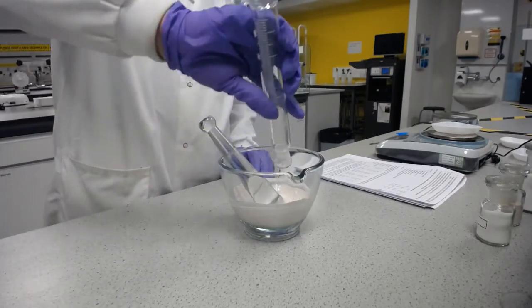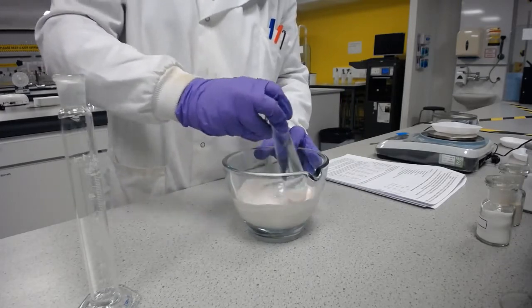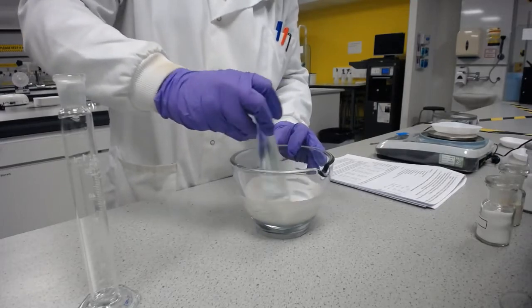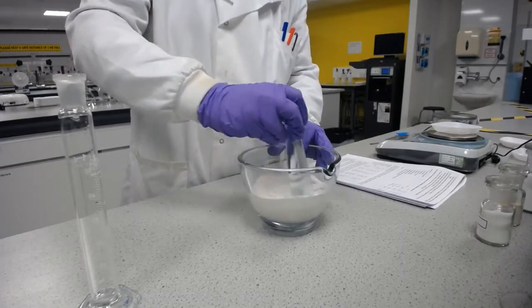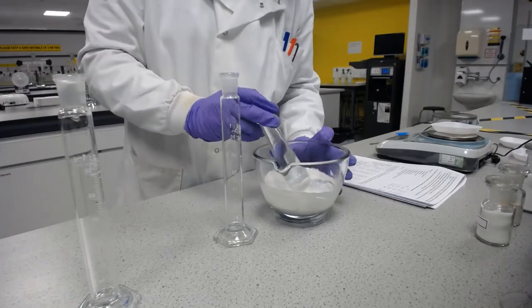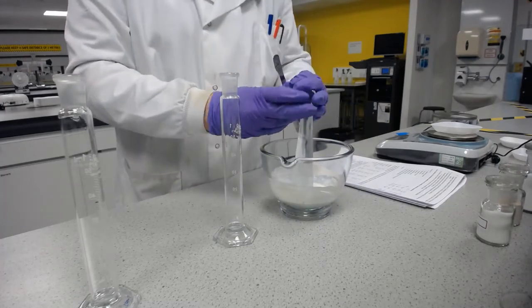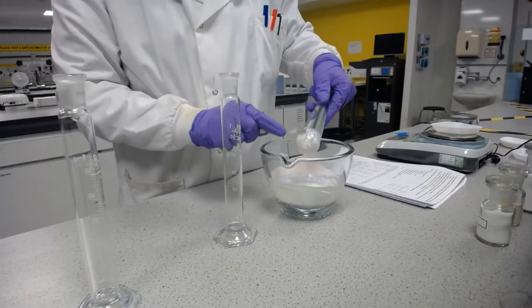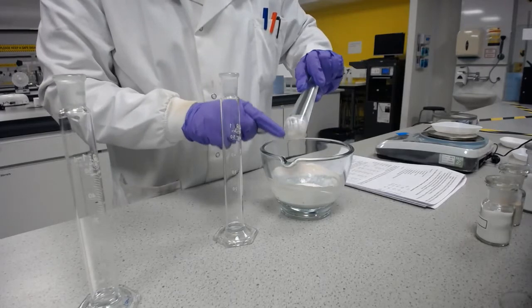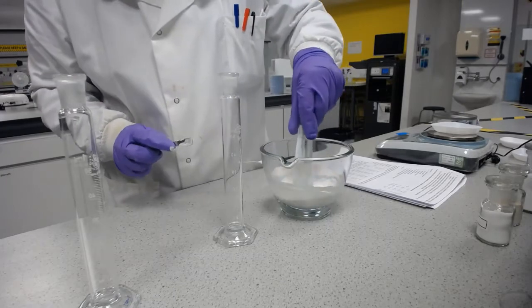I'm going to put a bit more water in to get this to a pouring consistency, and put it into the final measuring cylinder. Now once it's in the final measuring cylinder, you may wish to use a funnel as well to get it in, and you may wish to just scrape off any bits off the pestle, get them back in and make sure that they're incorporated.